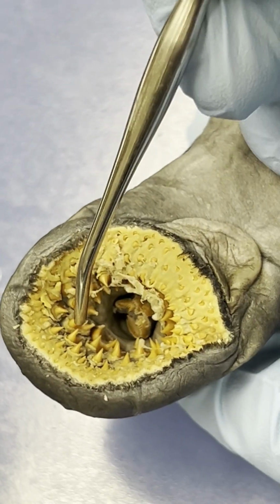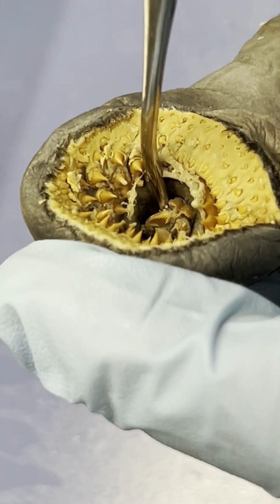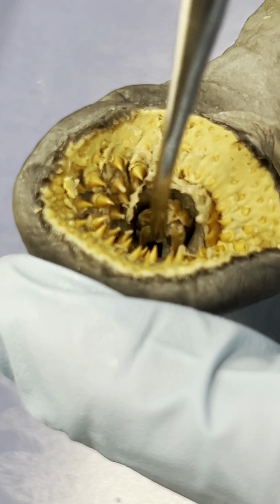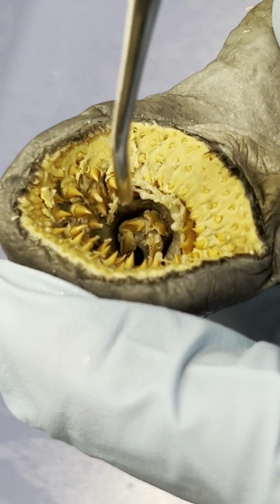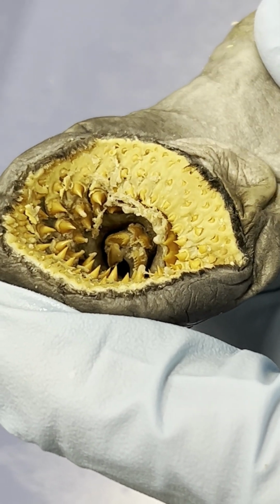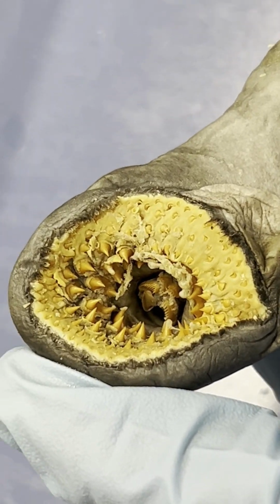Then we actually have its own teeth, which are all around here. Super impressive teeth, to be honest. And then we also have the tongue, which is right here. Is it shown in the video? Yep. So here's the tongue, and keep in mind the tongue has three individual teeth, and that tongue, again, will kind of shoot out like this to start feeding on whatever fish host that it's attaching to. And the three teeth there are a lot thicker than these teeth right here to help the animal start digging into the flesh of its host fish.